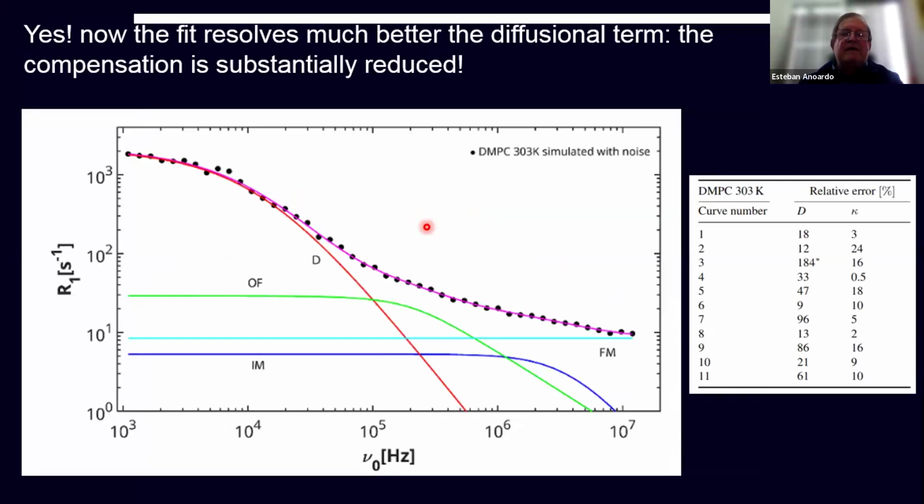So we can trust that the model is approximately reproducing also the behavior at lower fields. This is a region where one has to compensate the external magnetic field if we have an important field around the machine. It's tricky, but this is just for testing the fitting engine here, with synthetic data, and we assume that all this data, simulating experimental data, are okay.